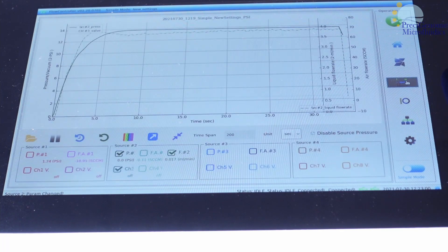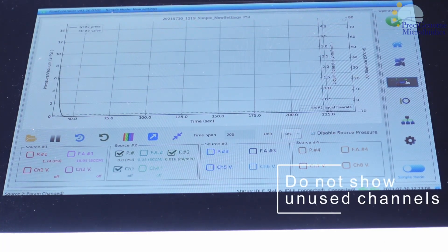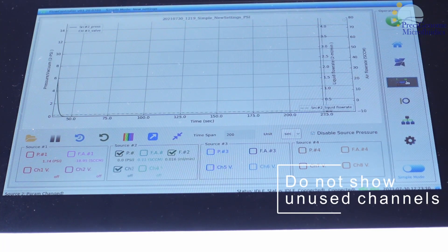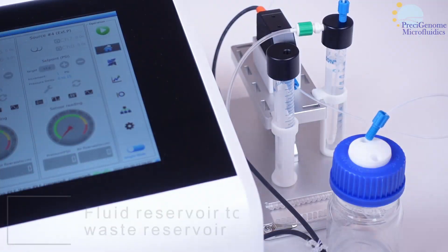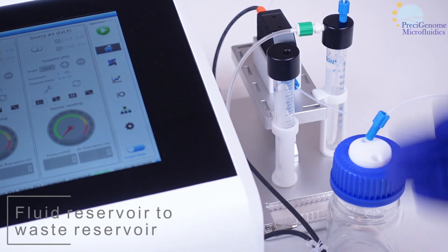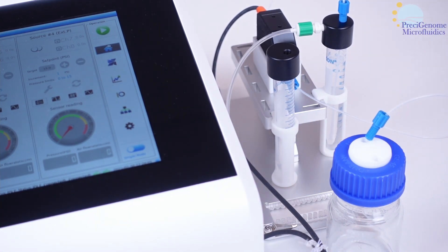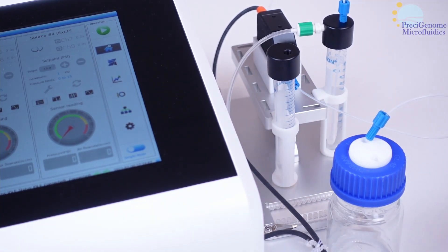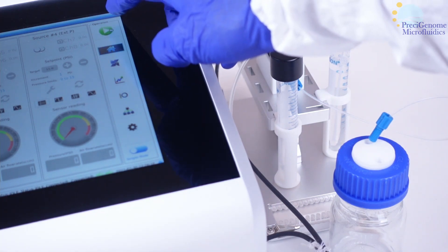Go to the live feed and disable any unused channels. Start with your fluid reservoir connected to a waste reservoir. We need to control when we start transferring fluid to the collection reservoir.